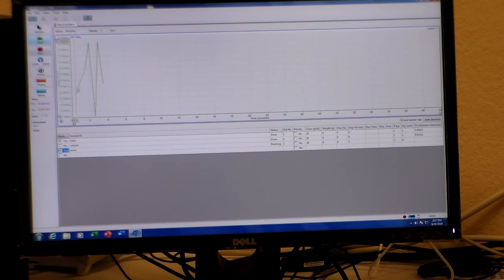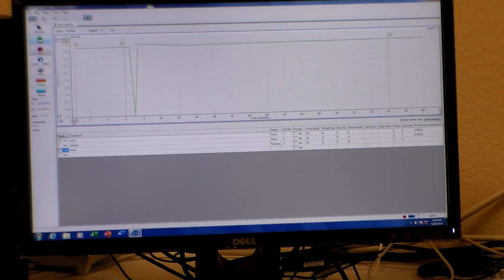And the system has started recording data. And the Y501 has just injected the sample. And what we're seeing is that the viscogram is very flat, and that's what we expect since vial 3 is just a wash vial with IPA, and there really should be no intrinsic viscosity in that vial. Okay, and the intrinsic viscosity for vial 3 was calculated to be 0.0002, and that shows us that all the sample from vial 2 has been cleared from the system, as expected.